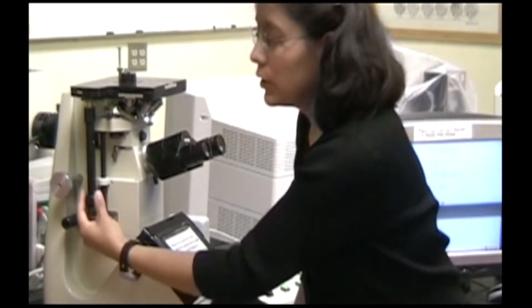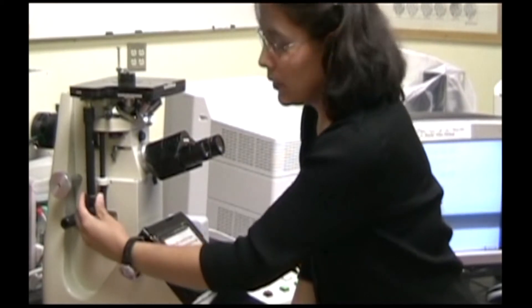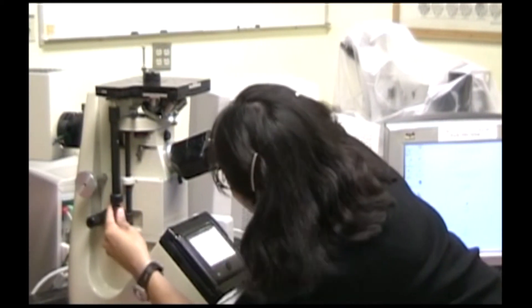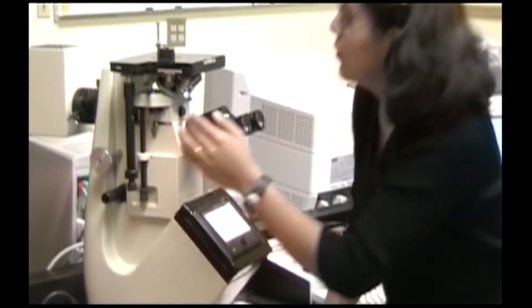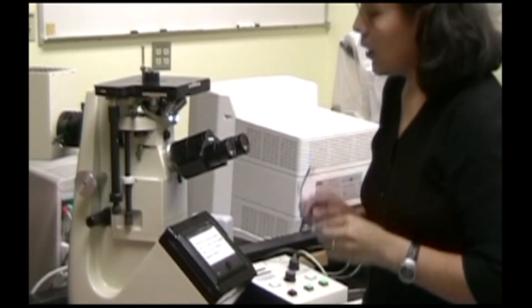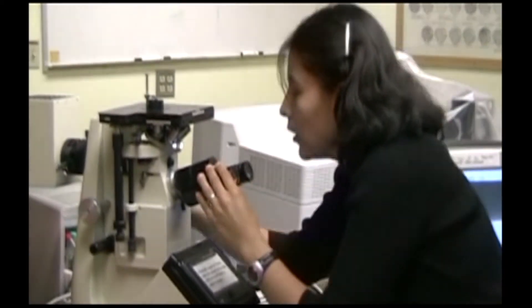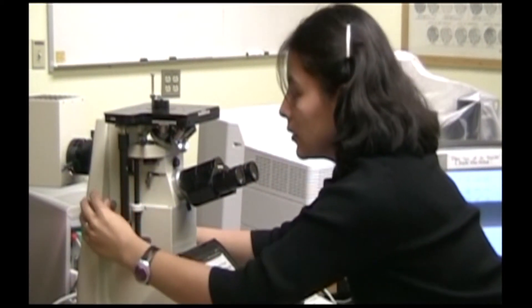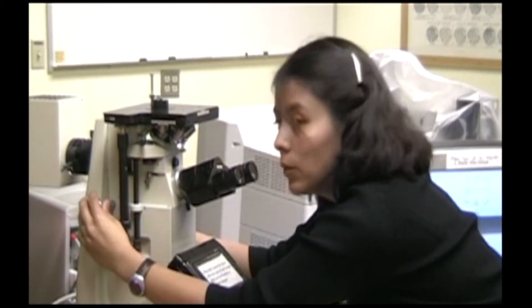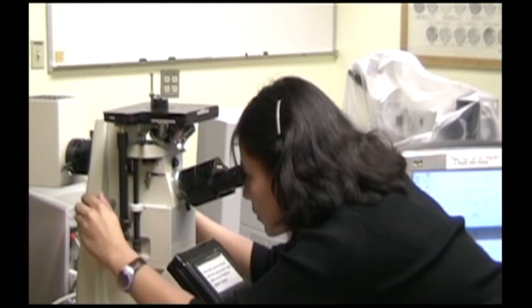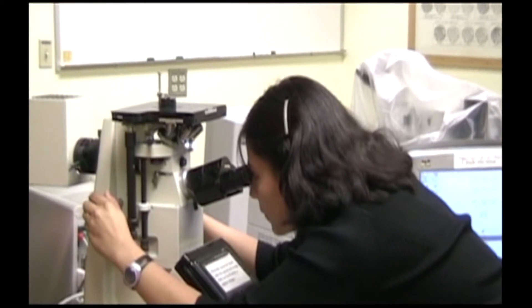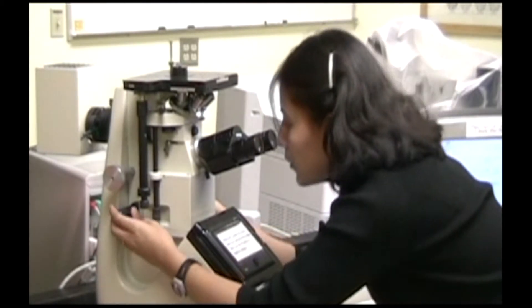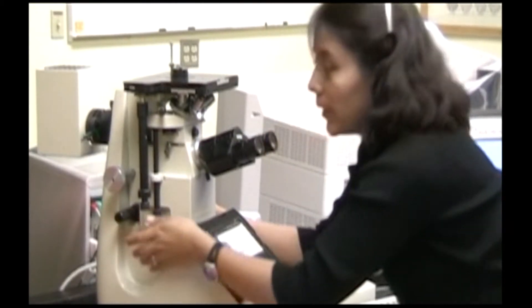Position your specimen so that the light is shining on it using these controls. While looking through the eyepiece, you should adjust the coarse focus knob and move your sample surface away from the objective lens while focusing. You can adjust the fine focus knob to further make the image more distinct.